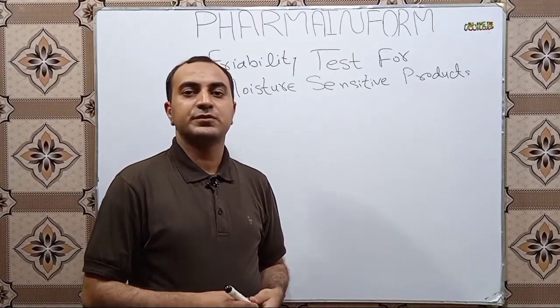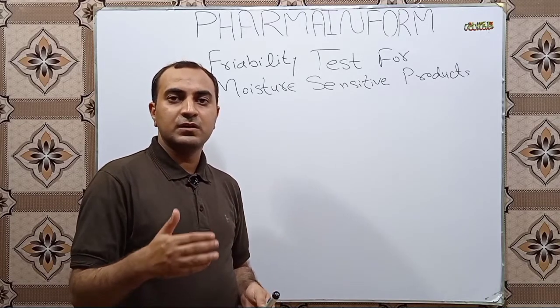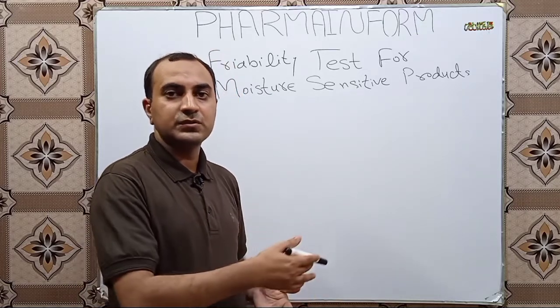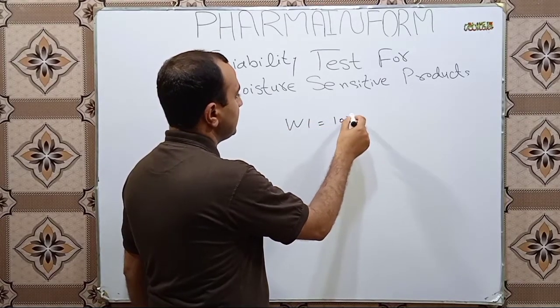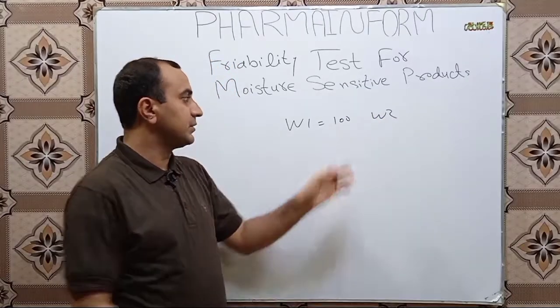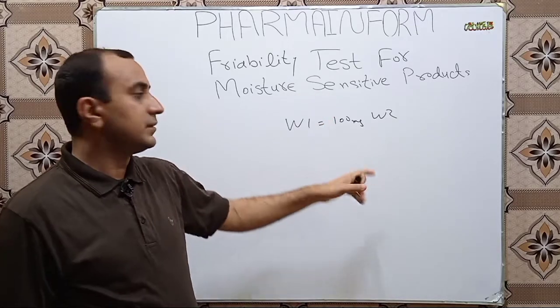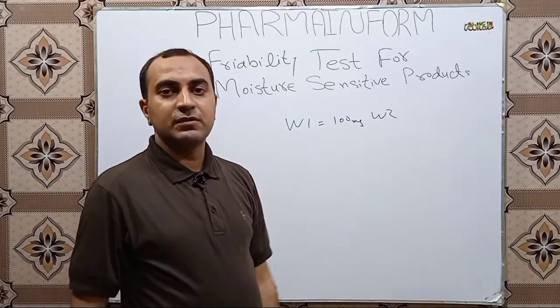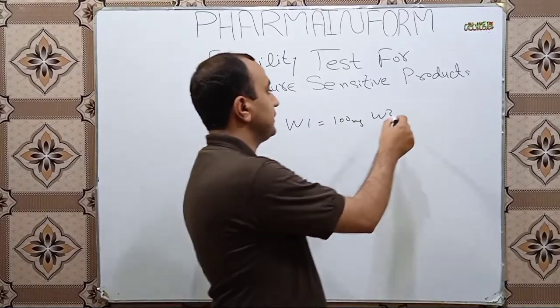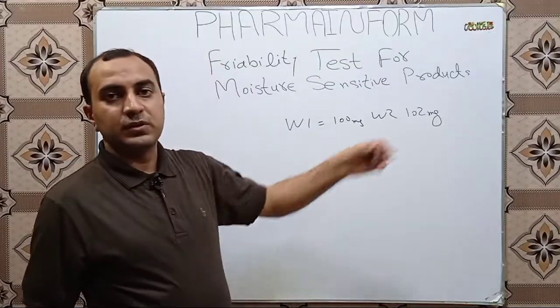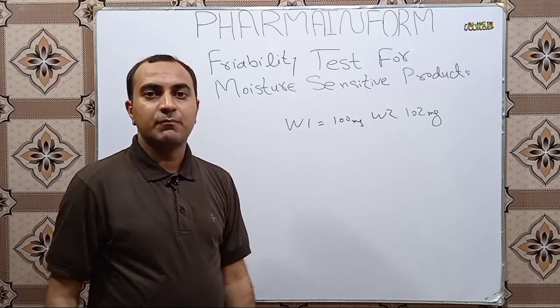The problem is that when we perform friability test for moisture sensitive products, we find our initial weight and after friability we calculate our final weight. The final weight is larger than the initial weight. For example, W1 is 100 mg, but W2 after friability should be less than 100 mg. However, for moisture sensitive products, the final weight is more — suppose 102 mg — and when we calculate friability it comes in negative values.